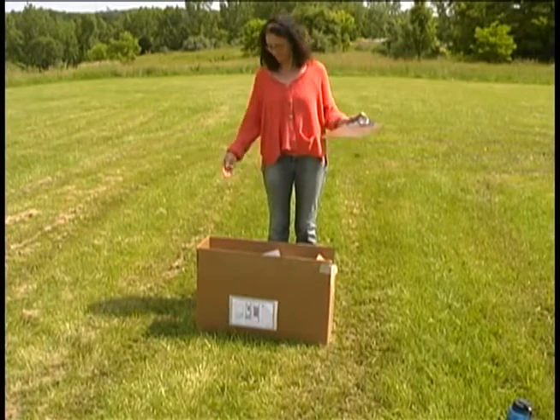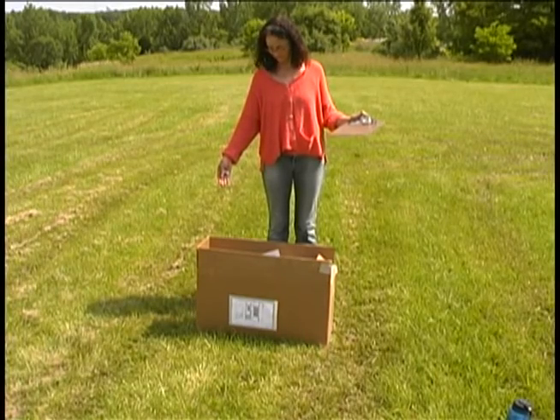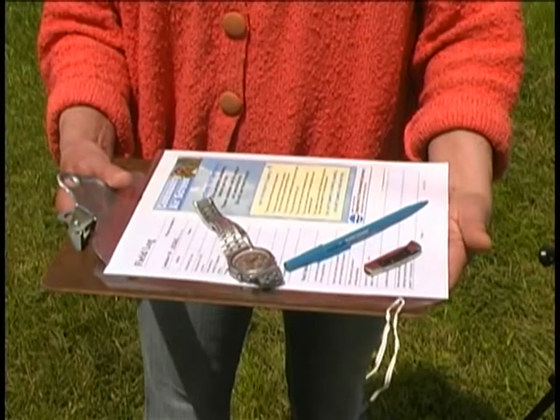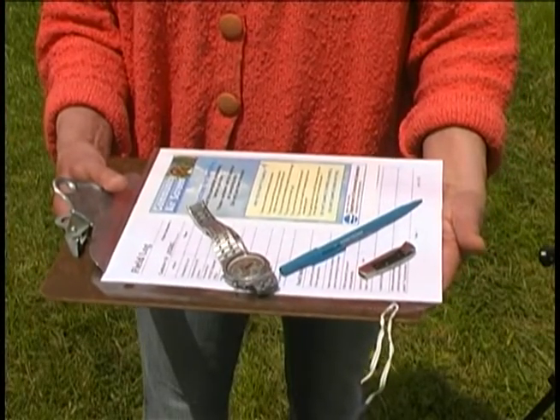We have with us today the box containing the sampling canister, something to record the time, a pen, a clipboard, and something sharp to open the box.